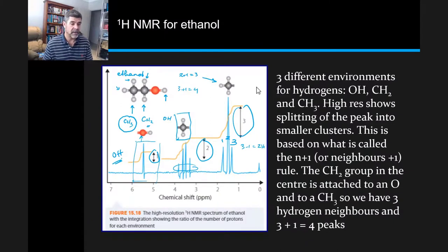When we put this information together with the outputs that we got from our carbon-13 NMR, we're starting to get a bit of an idea of the different types and numbers of carbon and hydrogen environments that we have. And so we can start to make some more direct conclusions about exactly what types of molecules that we have.